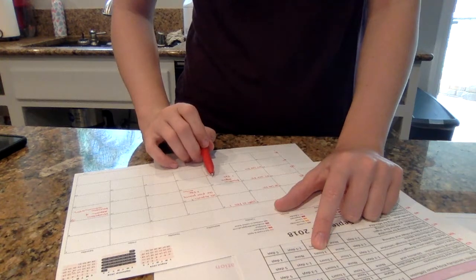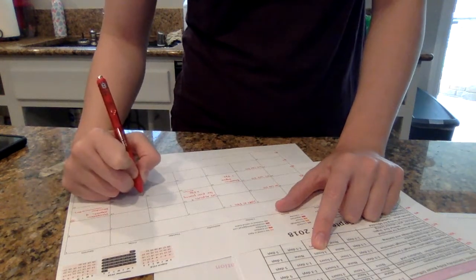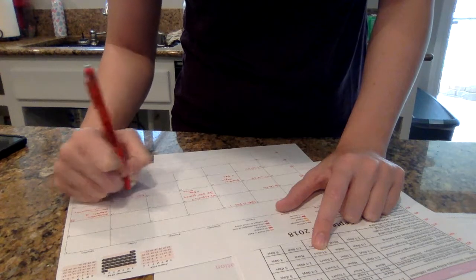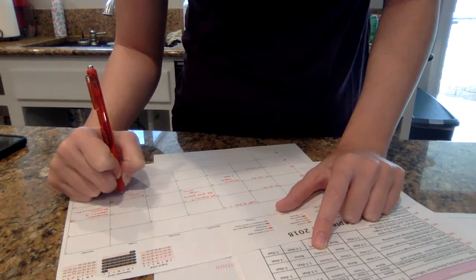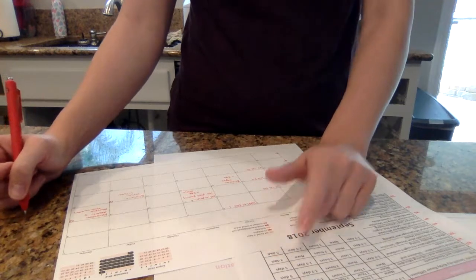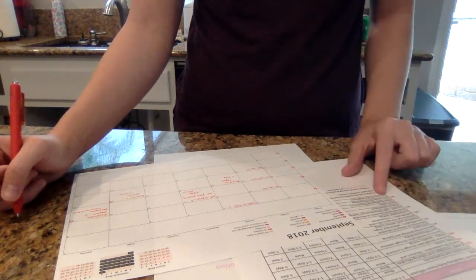So I will give this 1 to 3 days, 1, 2, 3, and hopefully by Friday I can look at this active culture. There's no incubation time, and it's an average of 3 days as well. That will be the only lab for week 3.